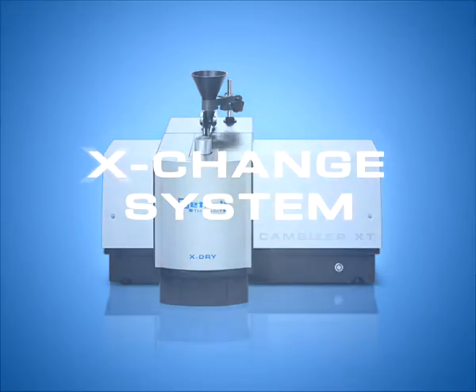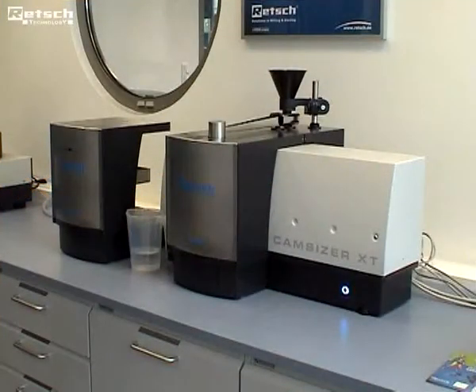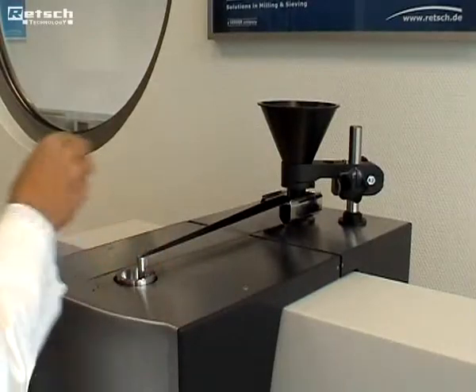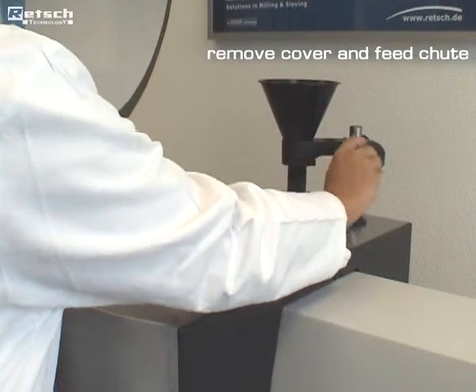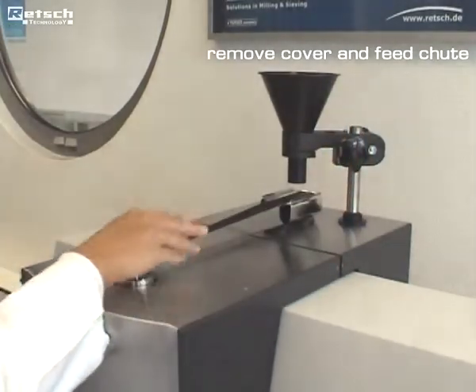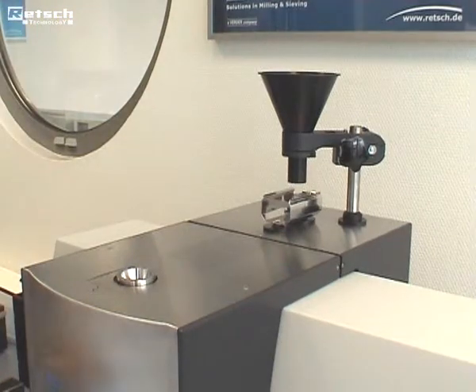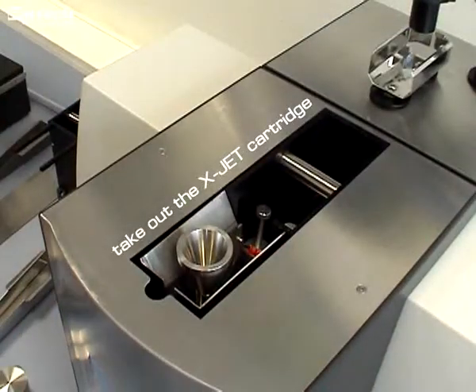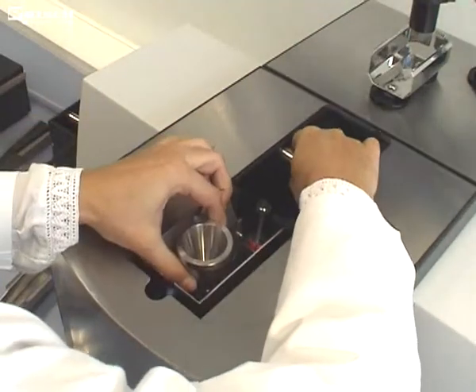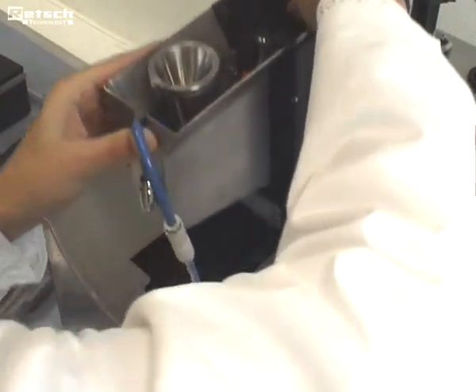We will now demonstrate the change from the high-pressure dispersion cartridge to the gravity dispersion cartridge. First, the feed chute and the cover of the X-Jet cartridge are removed. Then the X-Jet cartridge is taken out of the Dry Dispersion Frame and the pneumatic tube is disconnected from the quick coupling.